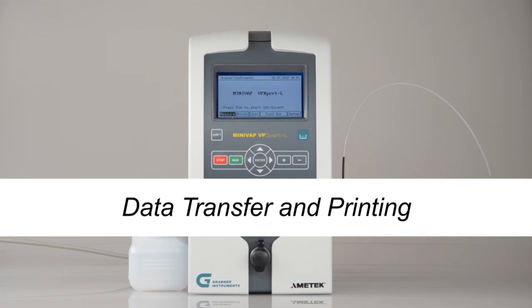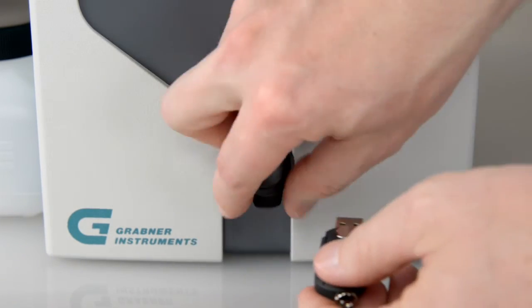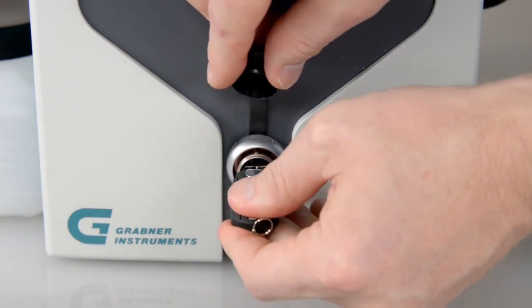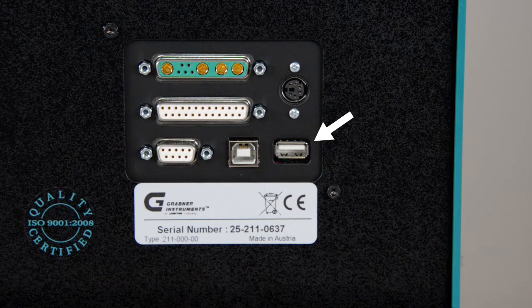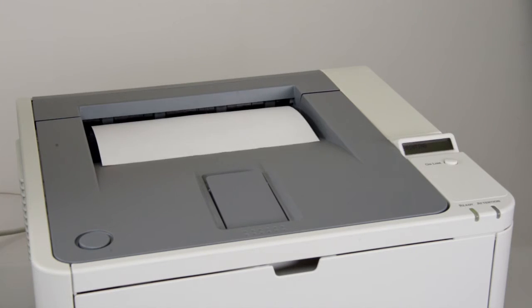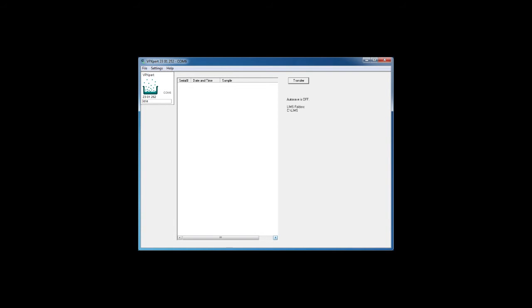Data transfer and printing. To download results, connect the USB device to the front USB port. To print results, connect a PCL compatible printer to the back USB port of the VP Expert. You can use the free MiniWin software to transfer your results data to your PC.